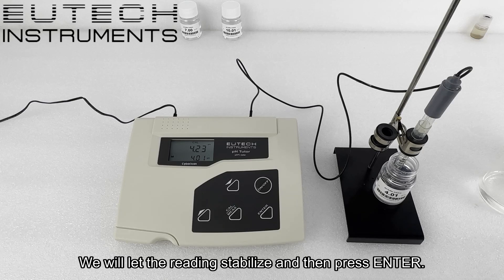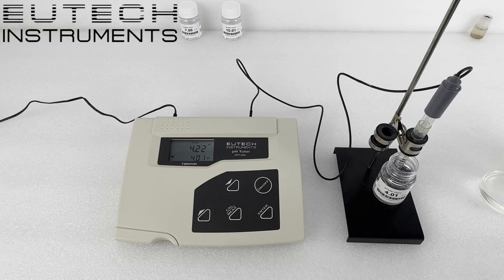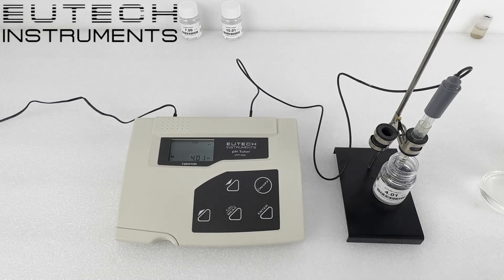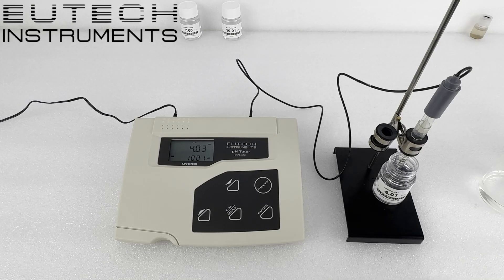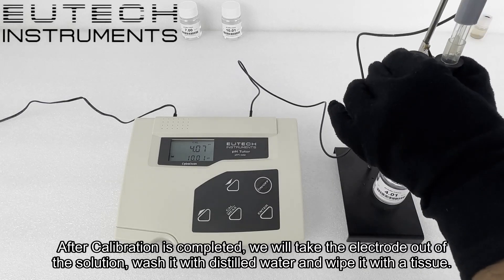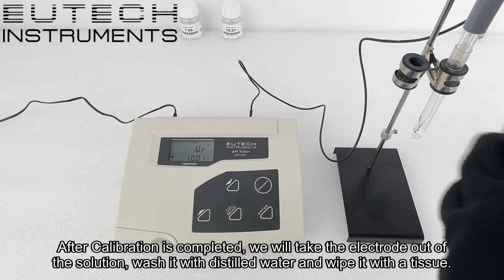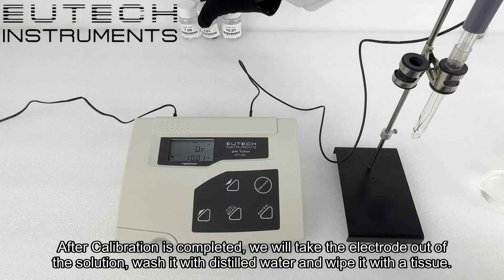We will let the reading stabilize and then press enter. After calibration is completed, we will take the electrode out of the solution, wash it with distilled water and wipe it with a tissue.